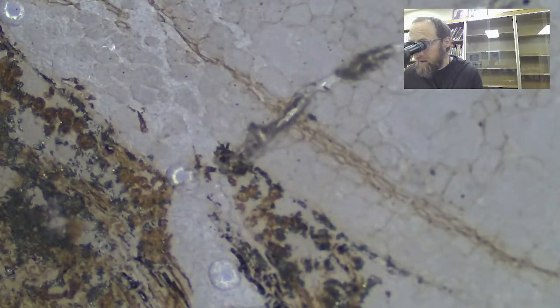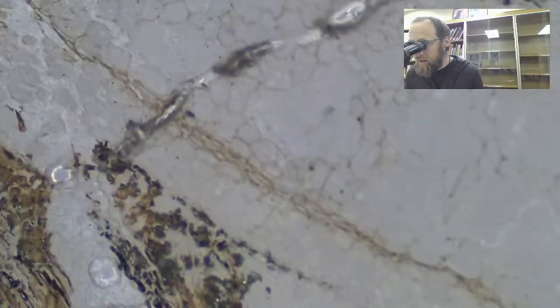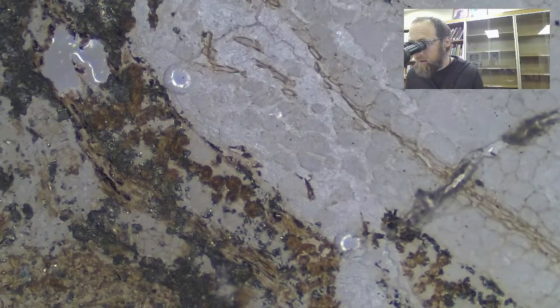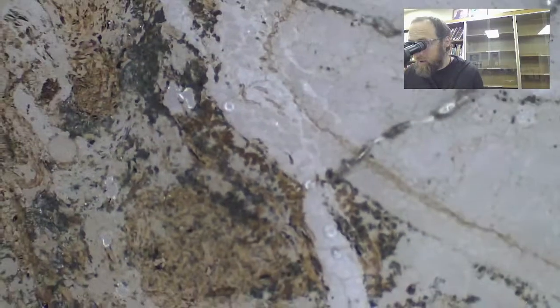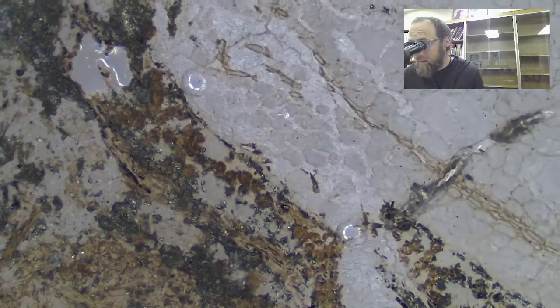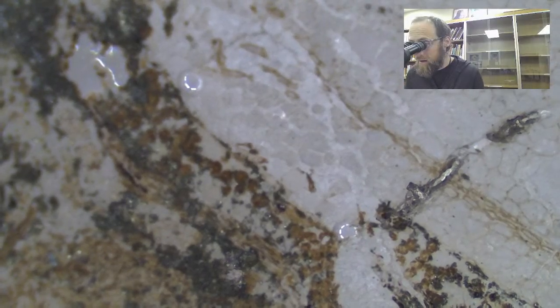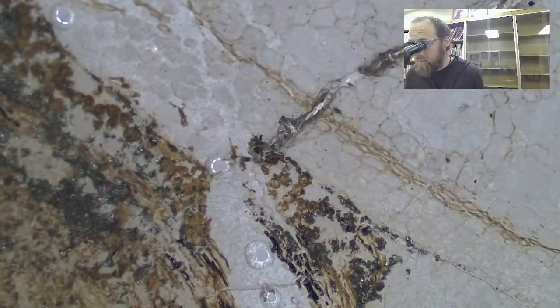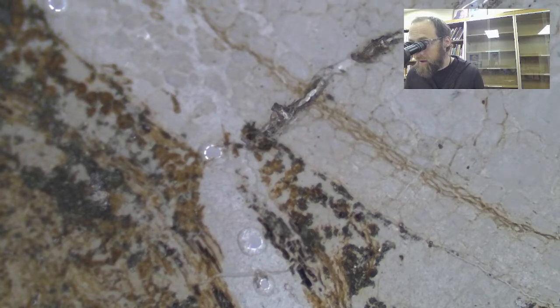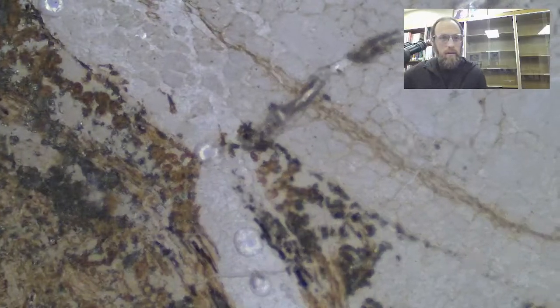So we go exploring, and then okay, look here. So that looks like some kind of accumulation of spore or propagule matter, something like that. That doesn't seem, at least not in any primary way, to be associated with a containing structure.